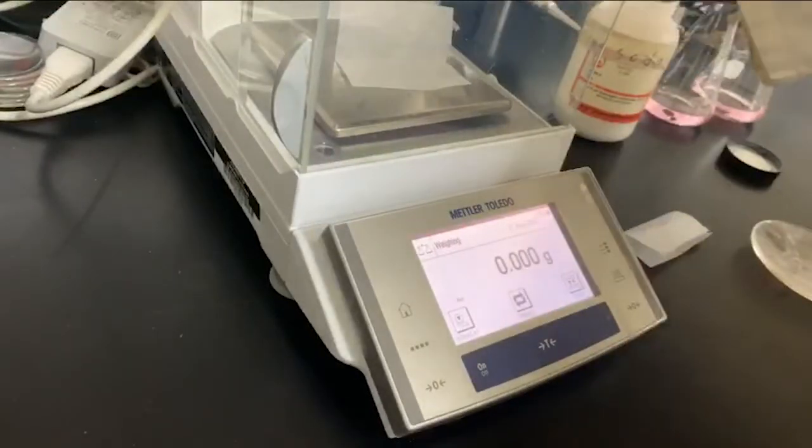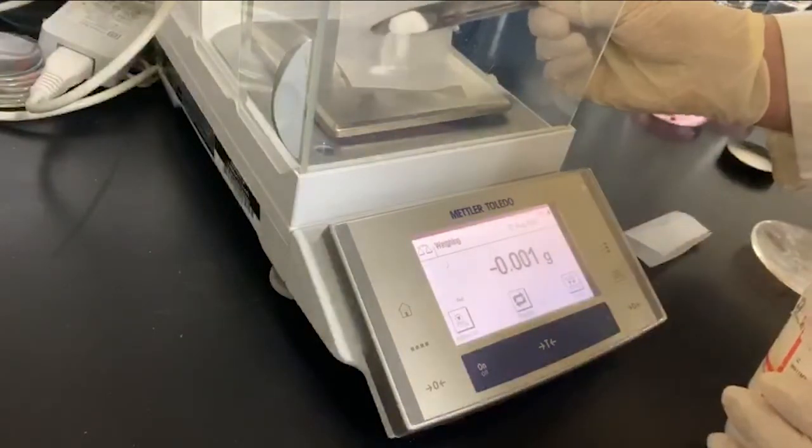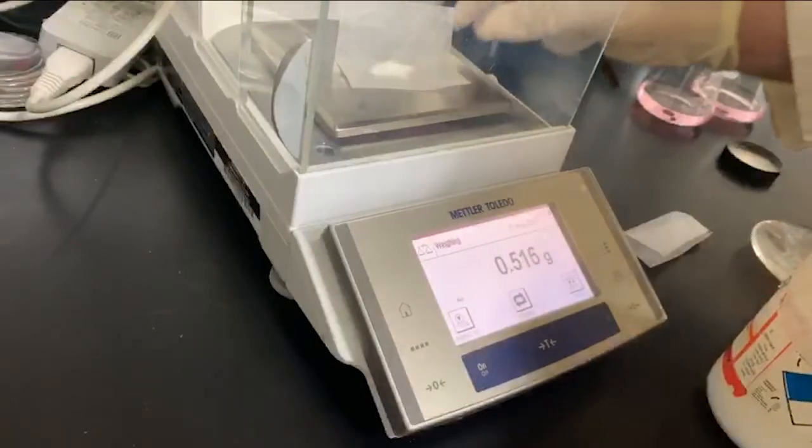Alright, so we've already tared our balance to 0 and got our weigh paper on there, and we're going to get 2 samples here of baking soda, and we're going to try to get about 0.25 grams.